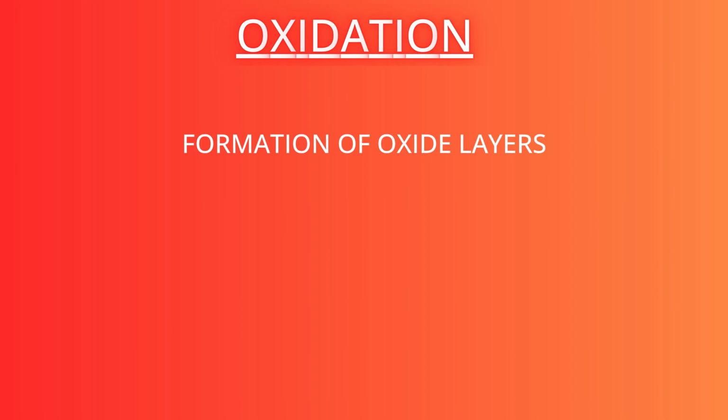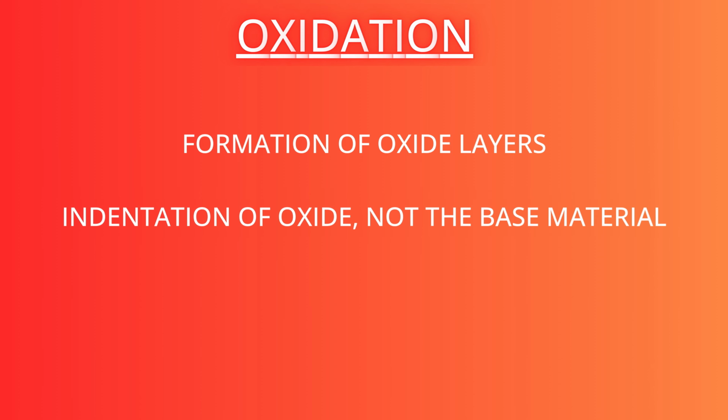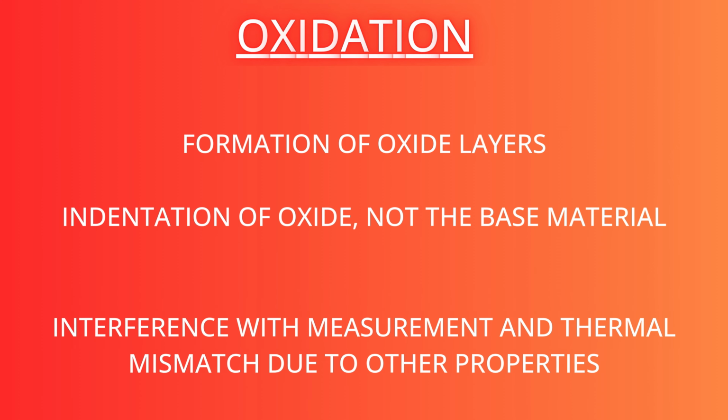And why is this an issue? You're no longer indenting the base material, you're indenting the oxide. And those oxides, like I said, are often brittle and are misleading in terms of the mechanical response compared to the base material. And those oxide layers can interfere with thermal stability and even the tip sample contact itself.